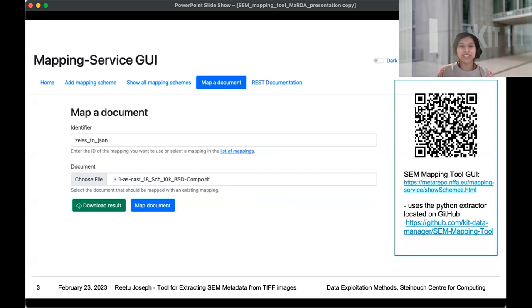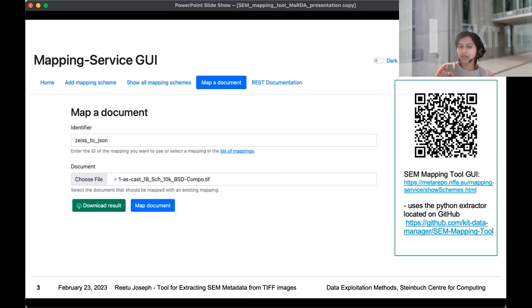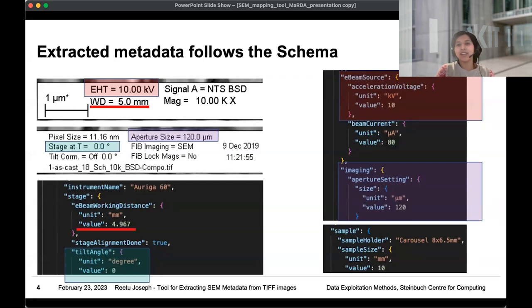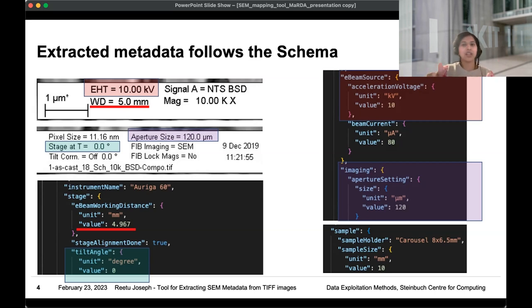For that, we introduced a GUI — a browser version. You can see the link or scan the QR code to go there, click 'Map Document,' and use that option to upload your TIF image. If you click on 'Map Document,' you get your JSON file as a download. That JSON file will have your metadata. As you can see, EHT is now mapped to acceleration voltage on the E-beam source, so it is coming under the proper schema format.